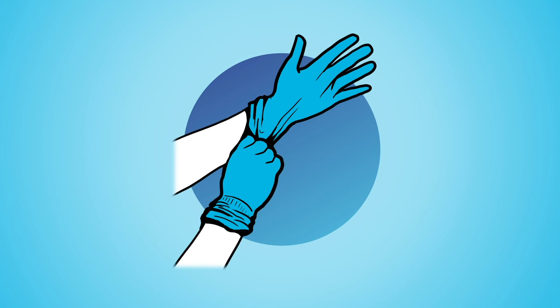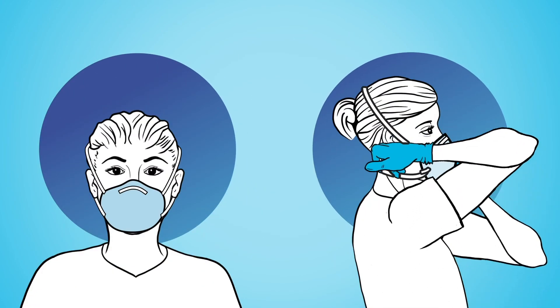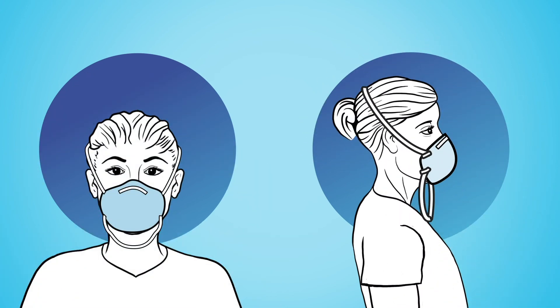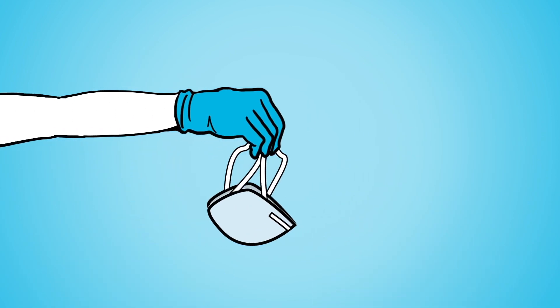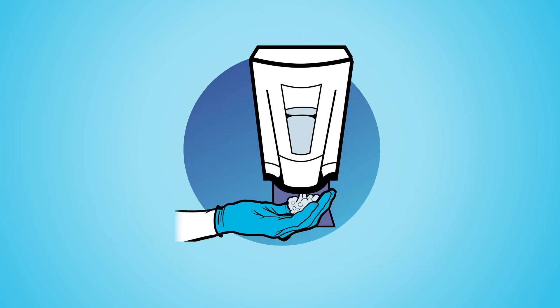Put on new gloves or sanitize your gloves before you doff the respirator. Pinch the bottom strap and pull it far over your head. Then pinch the top strap and pull it far over your head, letting the cup come off with the strap. Position and hold your N95 face down for conserving or discarding, and sanitize your gloves again.